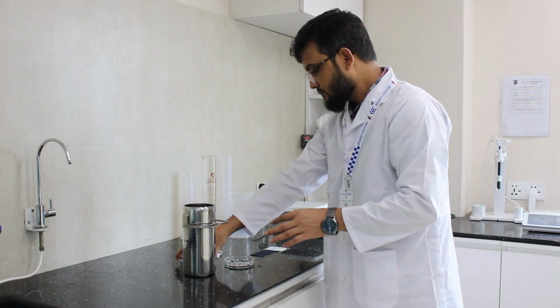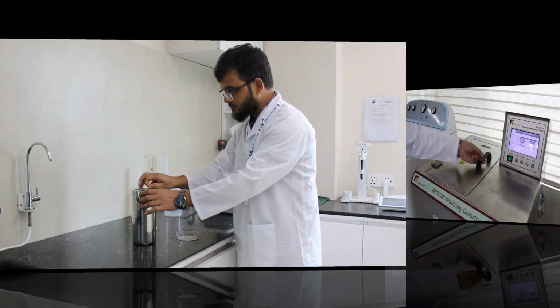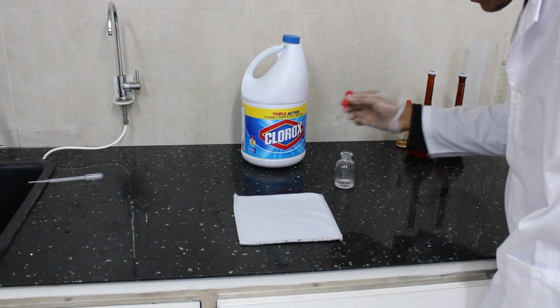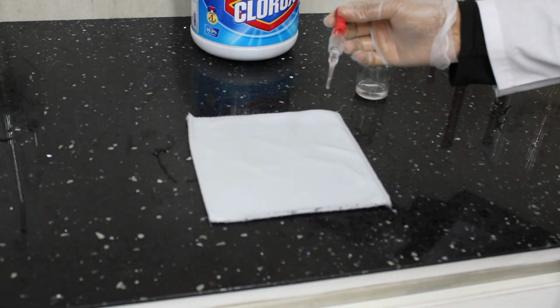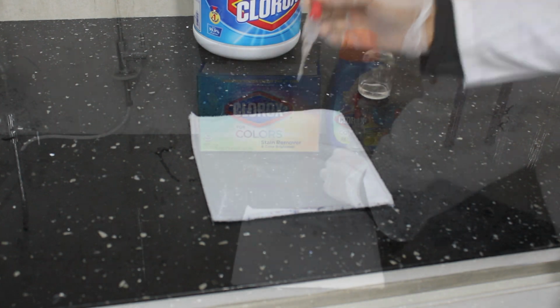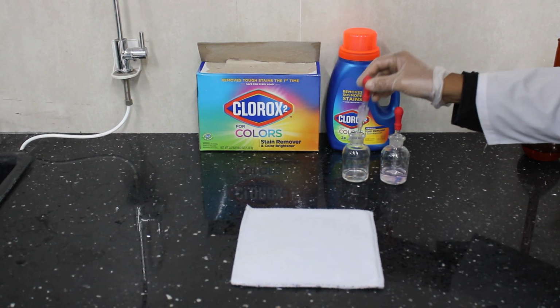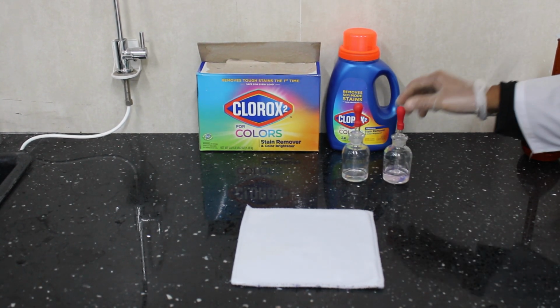Color fastness to laundering. Through this accelerated laundering test, color changes and color stains on fabric and clothing are evaluated. Color fastness to chlorine bleach. Chlorine bleach is a disinfecting agent. Chlorine levels are evaluated to ensure that fabric and garments are free of harmful bacteria. Color fastness to non-chlorine bleach. The purpose of this test is to determine the color change during the non-chlorine bleach test.